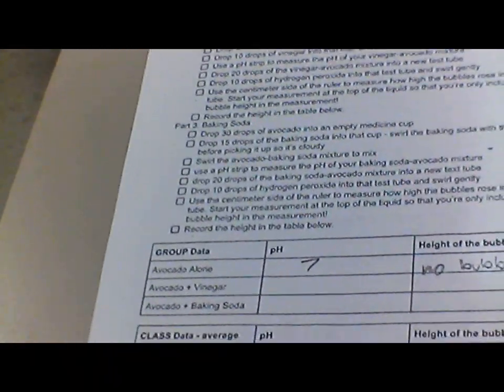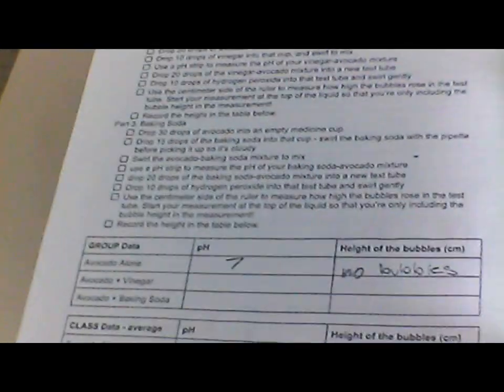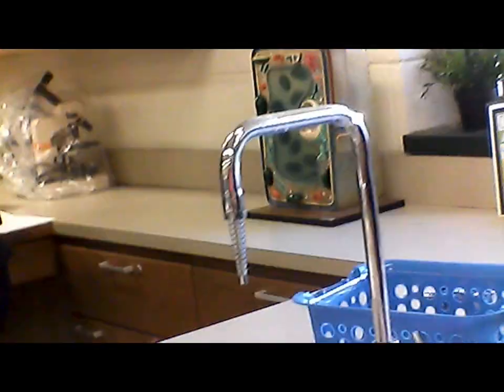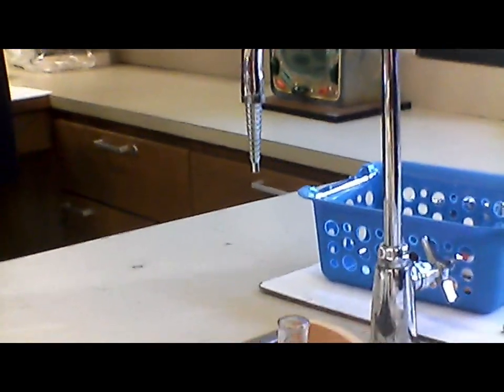Hey, Miss Williams? Yeah. It doesn't have the part on the graph for the hydrogen peroxide. That's your control, so that's the avocado alone. So it's just avocado and hydrogen peroxide. Uh-huh. No, it's still 7. And then you're doing avocado plus vinegar, adding the hydrogen peroxide, and then the third test tube is for avocado plus baking soda and the hydrogen peroxide. Does that make sense? Avocado, baking soda, and hydrogen peroxide?